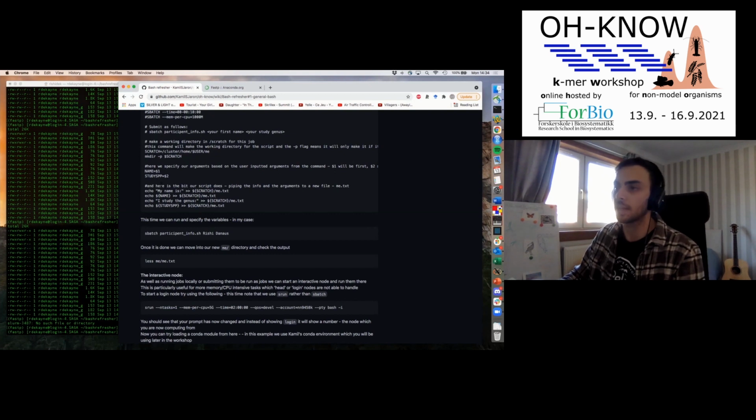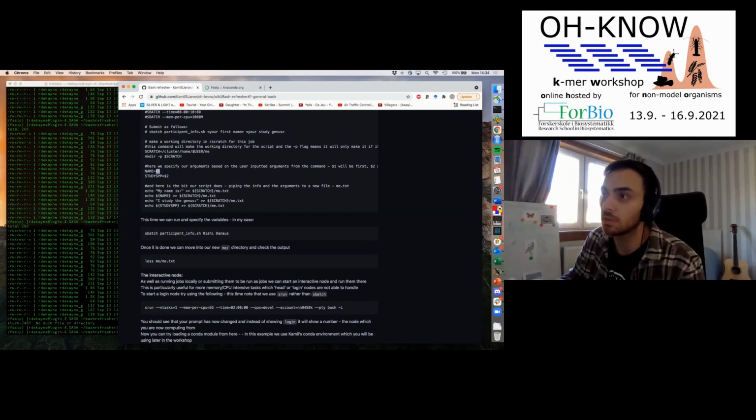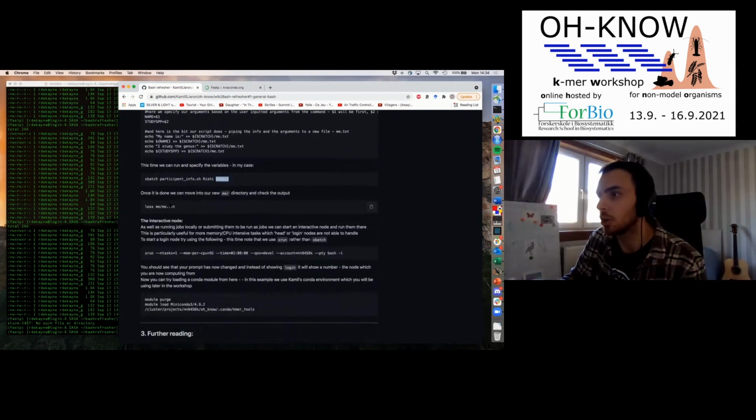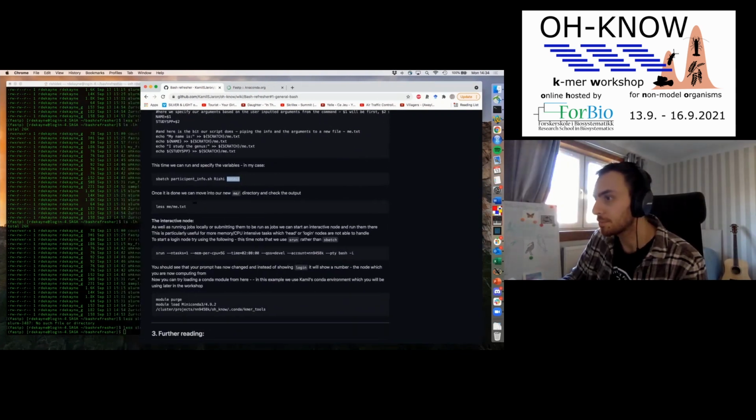So you could do something like, if you were using the fastp script, this $1 could be your forward reads and this $2 could be your reverse reads. And here you would just specify two different file paths for those. And you can look at this output yourself.